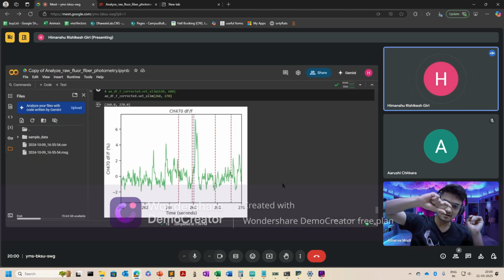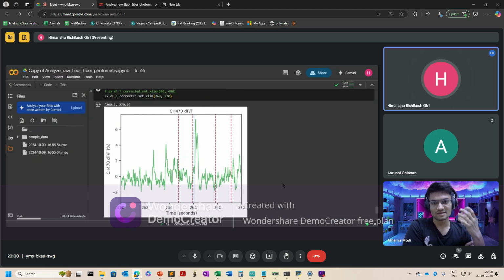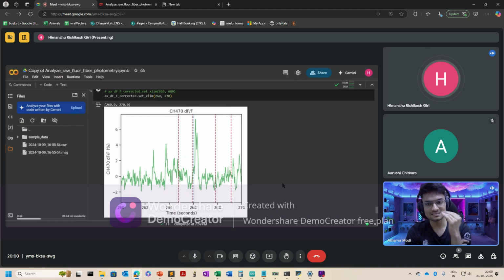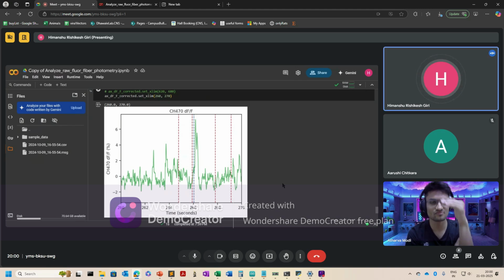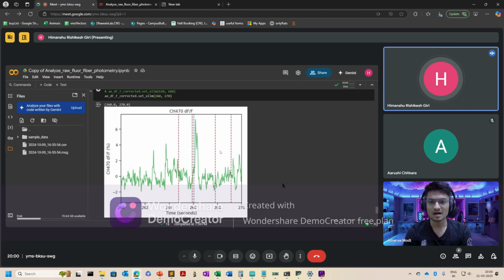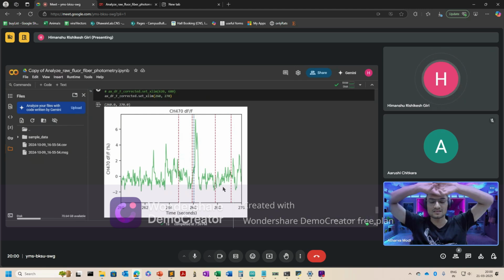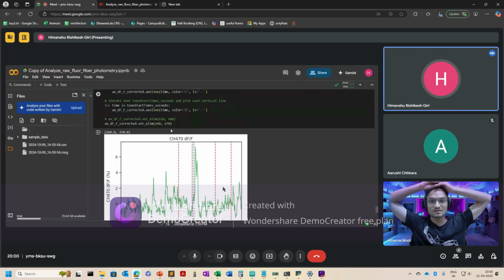That is another way. Then what will happen is that while it is pressing, you will always get some positive z-score value, so you can denote that as movement. Like, okay, it's already positive. Basically everything will shift up in essence. That would also give higher scores to these peaks, because the variation might be low there comparatively. Yeah, that's true.